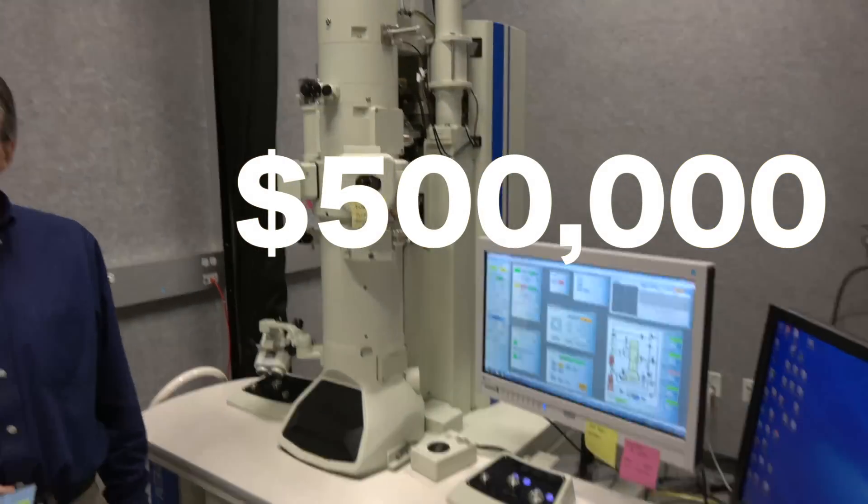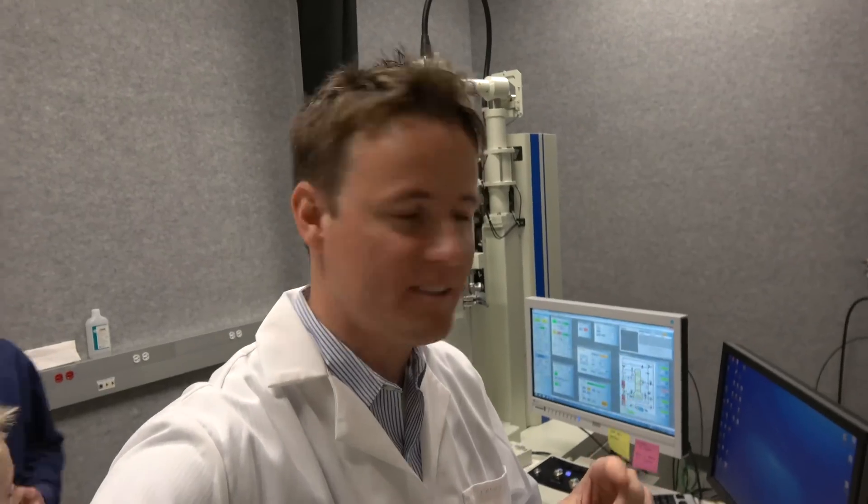Ballpark, how much does one of these guys cost? Half a million dollars. Half a million dollars for this microscope? Yeah. We're not cutting that one open. It's getting real in here, guys. Polio virus to its core. This is about to happen.